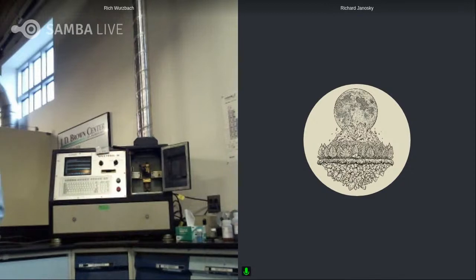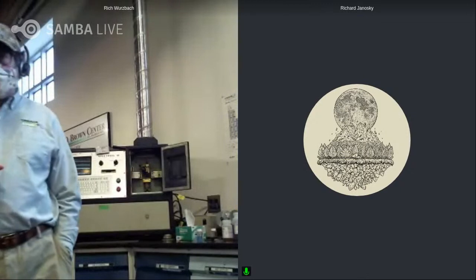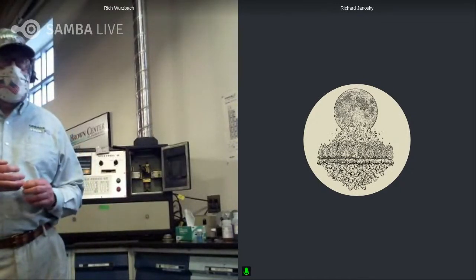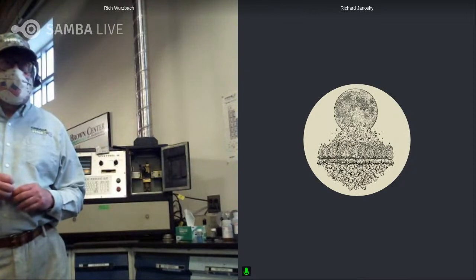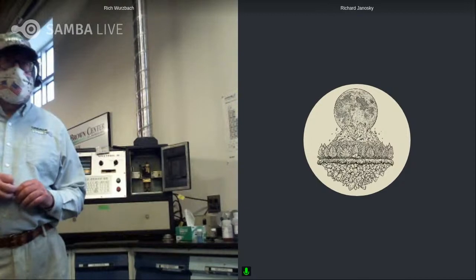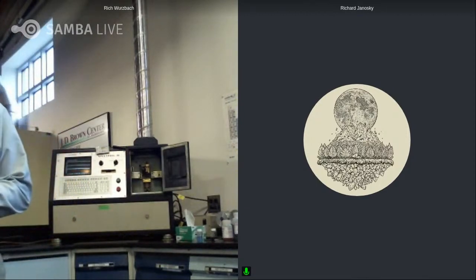Bobby had a question, and Lisa put a very nice written response in the chat about the PTFE greases. They were both talking about Krytox, and Lisa said they were able to get the solvent from Chemours and worked on that. However, that mixture wouldn't work with ferrography slides. It's like what we talked about during the presentation: it may work and dissolve for RDE, but then we might run into an issue with a different test.